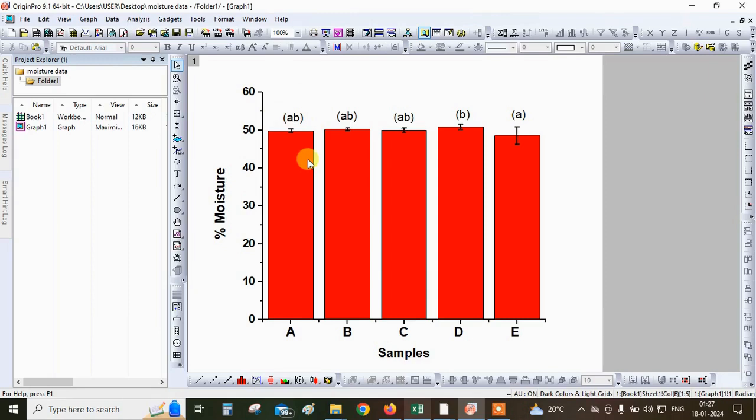So from the statistical interpretation, we can identify and pinpoint the interrelationships among the different samples. That is how the samples vary, how they are related to each other, how they are correlated, how they are linked with respect to one another, and you can also correlate your data with other experiments, and test your accuracy and validate whether your data is really right or wrong. We have to perform the statistical analysis.